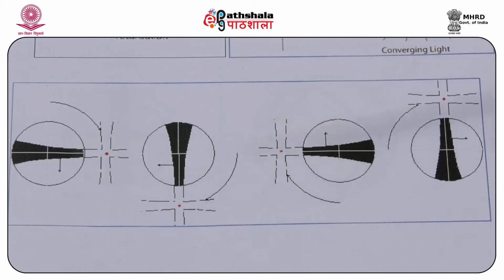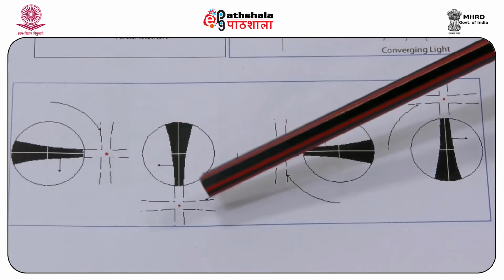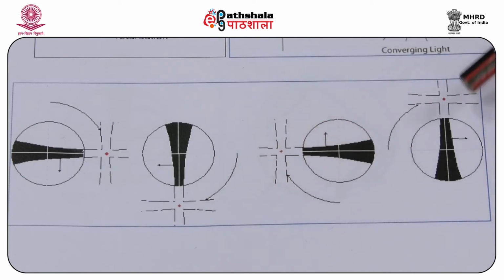We can find out the optic sign knowing the vibration directions of the ordinary and extraordinary ray in the northeast quadrant of the interference figure. As you can see in the figures, we have the melatope which is out of the field of view, which is marked in red.